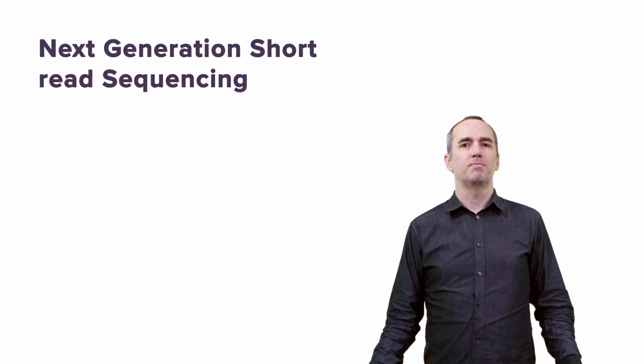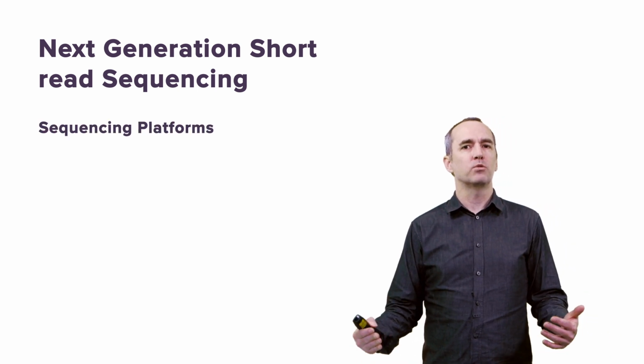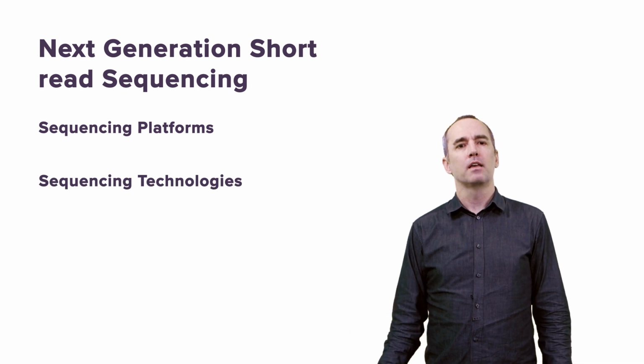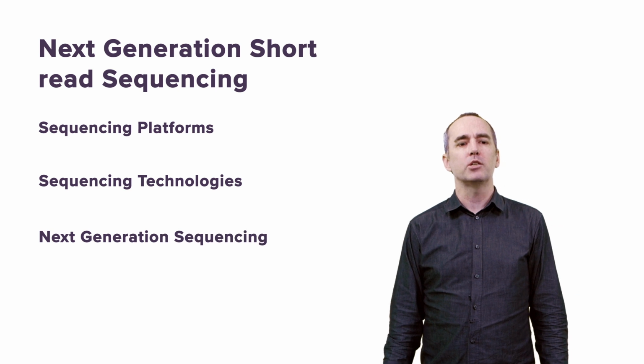This is a course in next-generation sequence analysis, and at the beginning of the course, we want to introduce what the sequencing platforms are and the different sequencing technologies. I also want to introduce what we mean by next-generation sequencing.